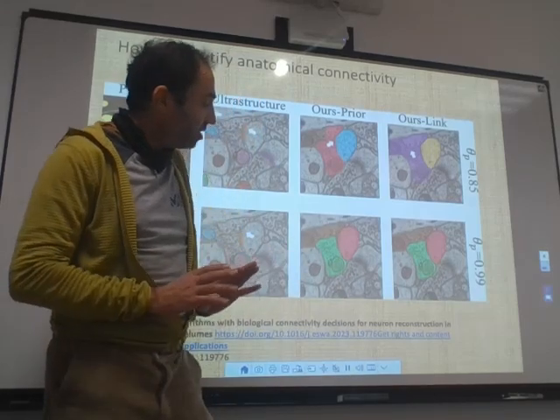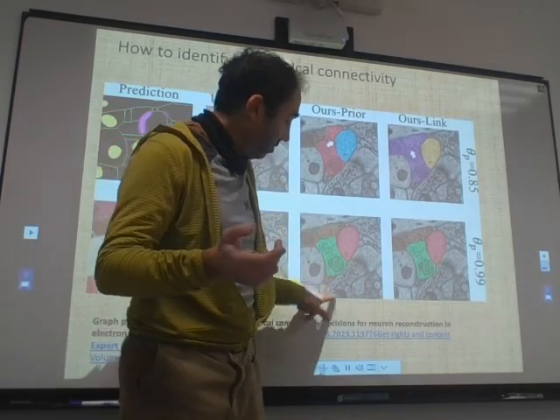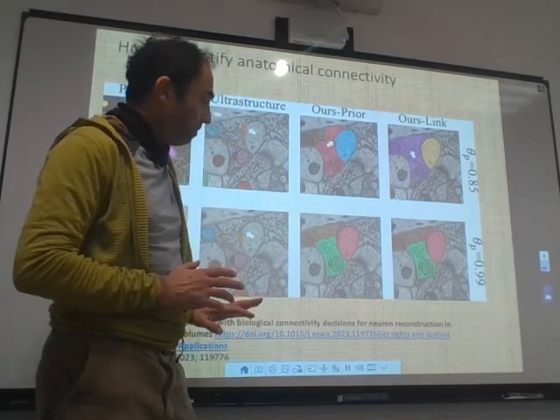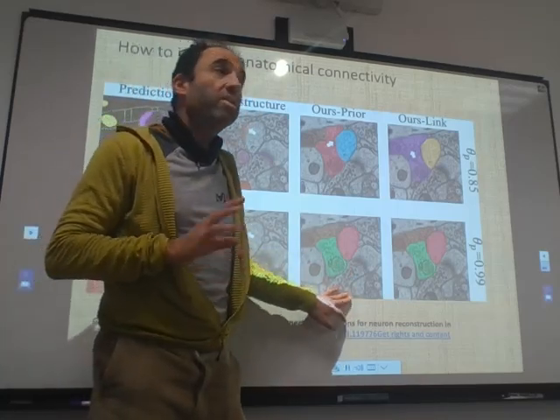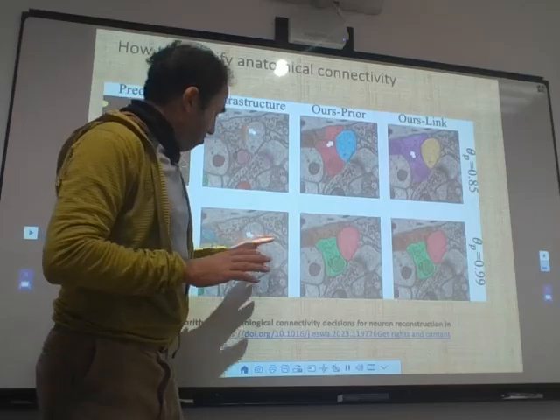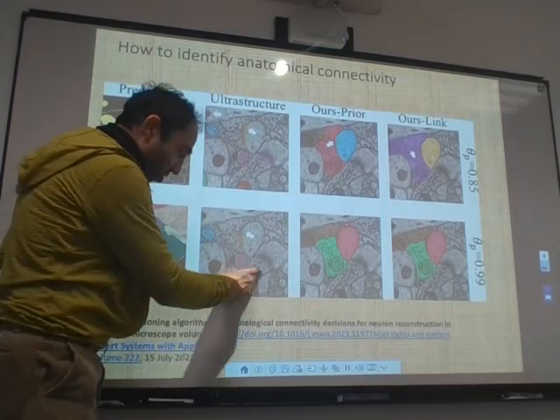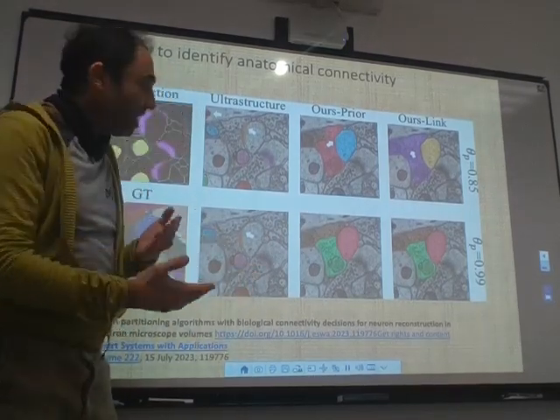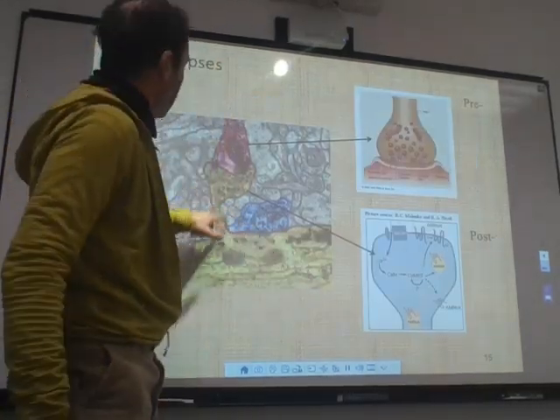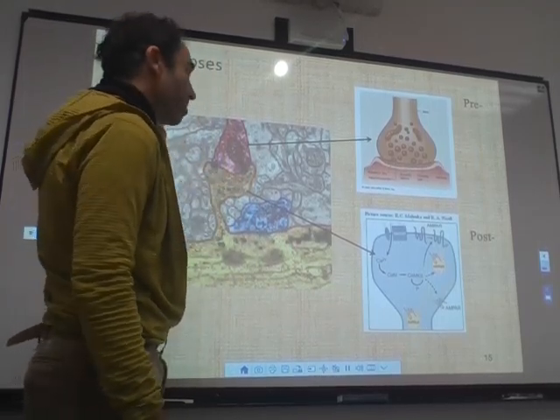So we can say this is not necessarily a synapse, but this is something I want to keep track of. Maybe this feature can reproduce itself. So this is something we want to keep, although it doesn't have necessarily a clear interpretation. So you want to keep some information based on statistics, on local clustering, but clustering is not enough. Let me show you back what we have here. You see how accumulated they are to the surface, and sometimes it can be even more.